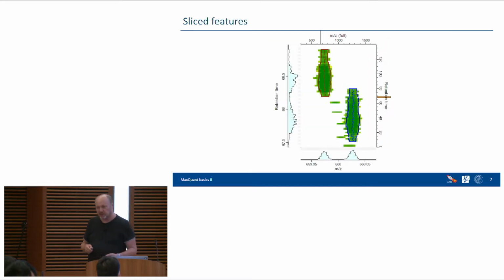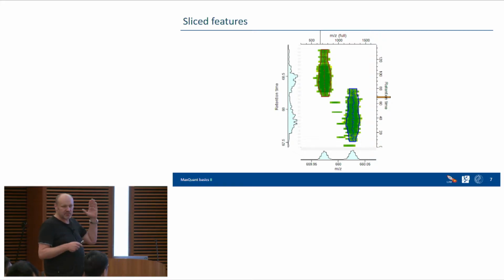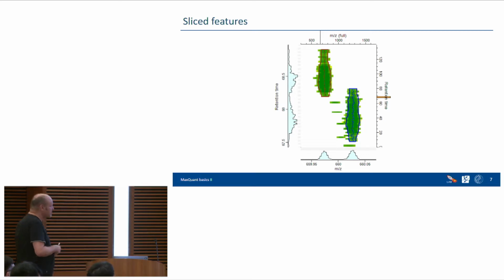And then we get peak shapes. So that could be some part of one of these slices, where you have mass and retention time, at one specific ion mobility value, basically, right? Then we do the feature detection there, and we get shapes that are surrounding the feature. So it's not just rectangles, but really nonlinear shapes that we determine in the data.